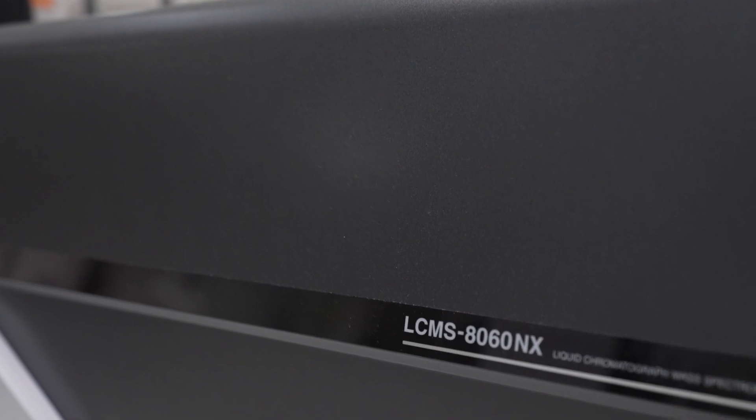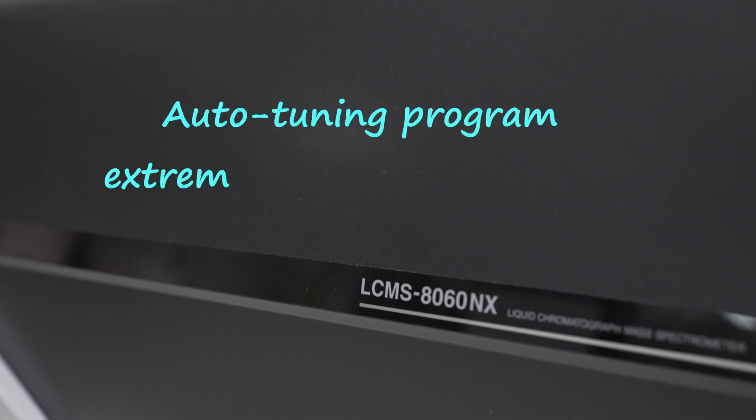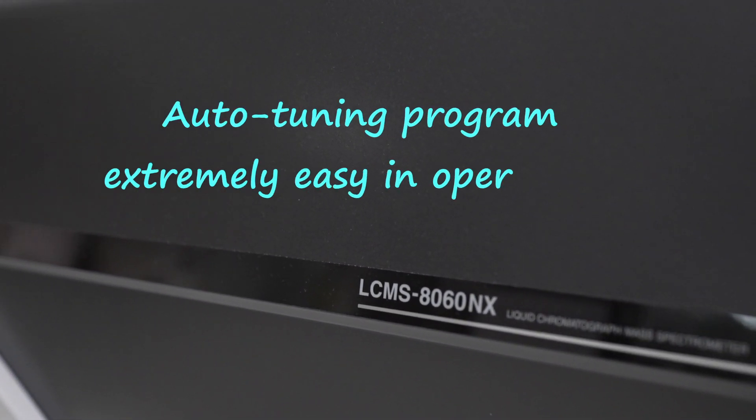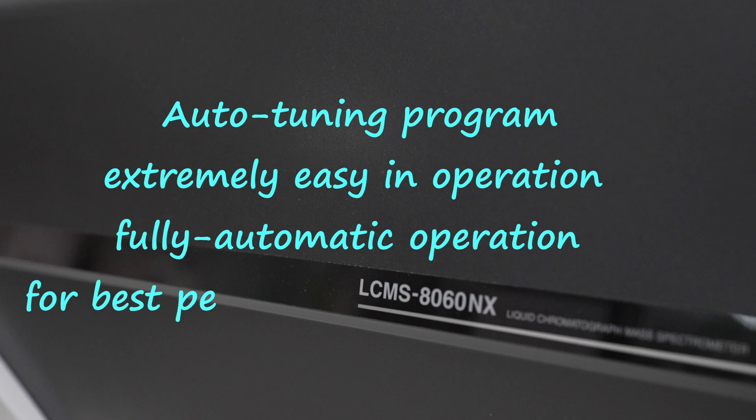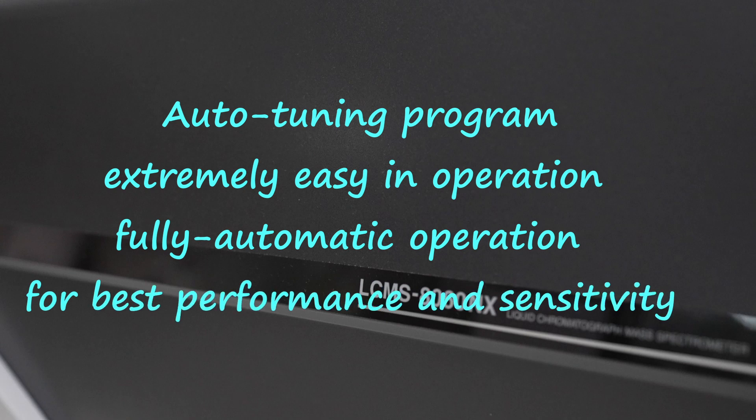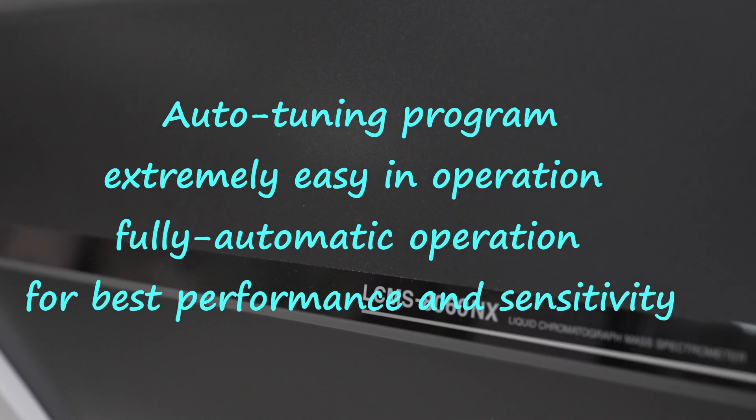Shimadzu triple quadrupole mass spectrometers are equipped with an auto-tuning program which is extremely easy in operation, non-expert required, and fully automatic operation for optimizing the ion optical system for best performance and sensitivity.